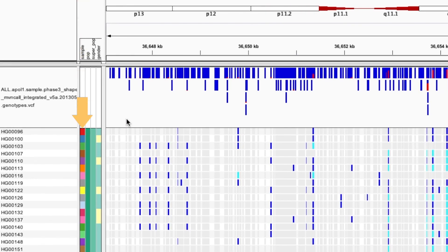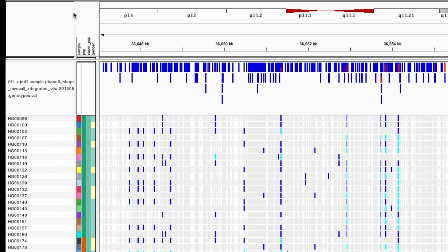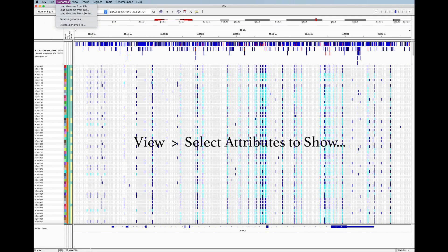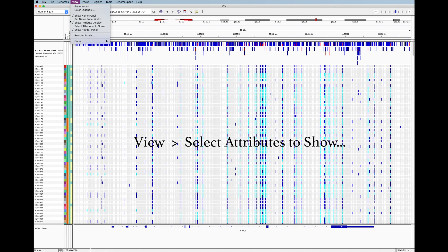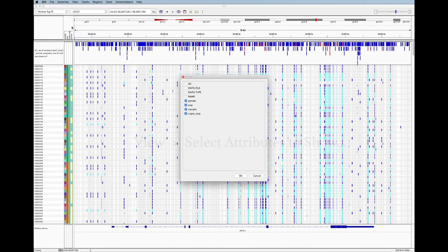For example, I don't think this sample annotation is useful. You can remove it by going to view, select attributes to show and deselecting the one you don't want.